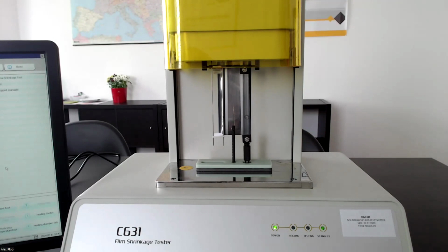Correct me for what I understood. For each type of sample, we need two strips, which we test simultaneously, and for one sample type, we get one test each time. Is it okay? This is correct. Thank you.